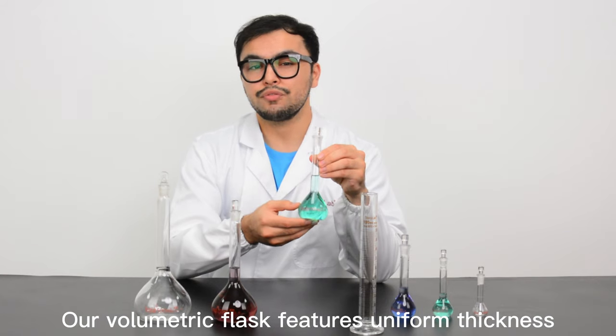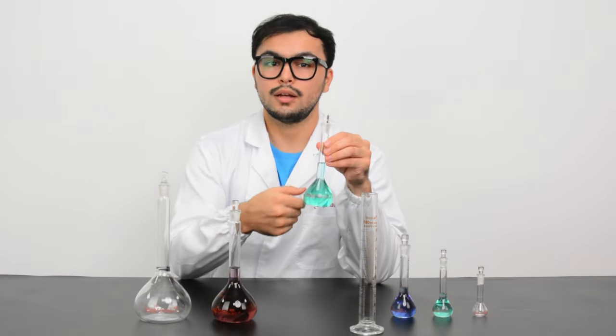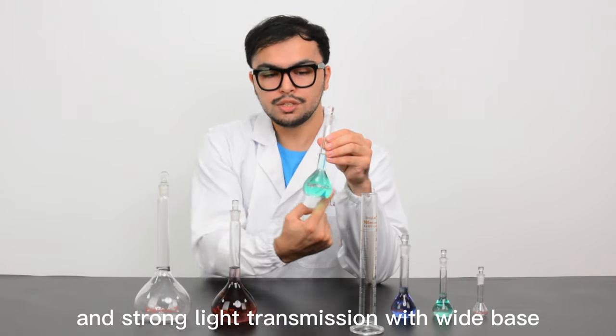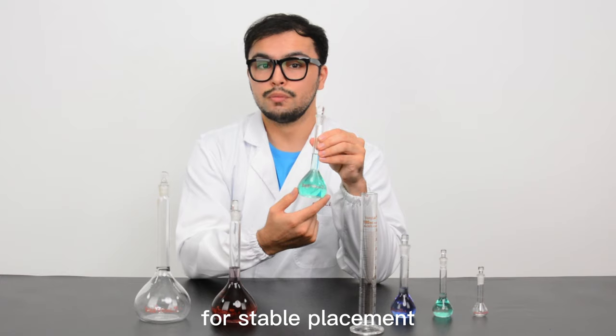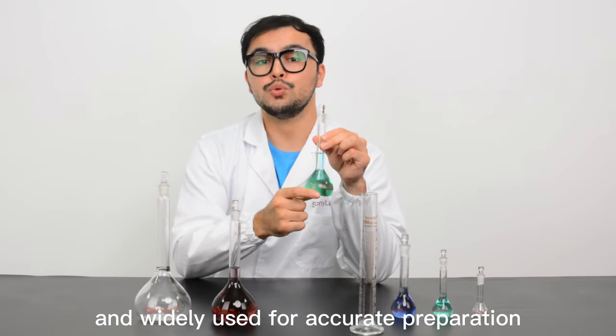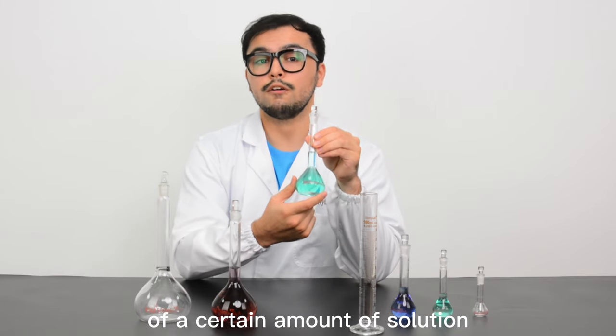Our volumetric flask features uniform thickness and strong light transmission with white base for stable placement. They're clearly marked right here and widely used for accurate preparation of a certain amount of solution.